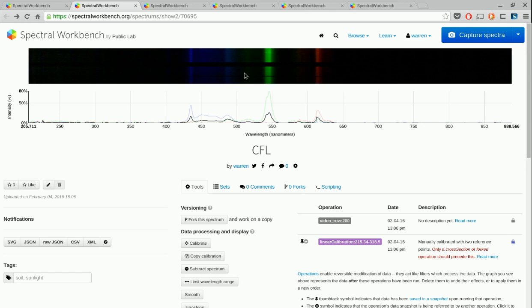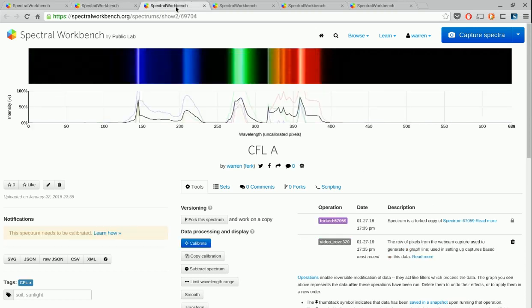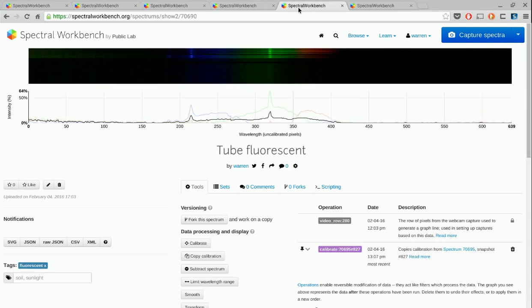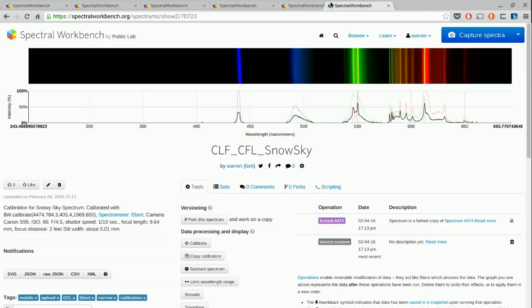Now, this is not a particularly good example. This is the one I just used. But if you look at some of these other examples, this one is overexposed, it's blown out, but you can still see the features pretty well. The lines are really quite separate, quite distinct. And also, we recognize them. This one, not so much. I'll tell you why in a moment.